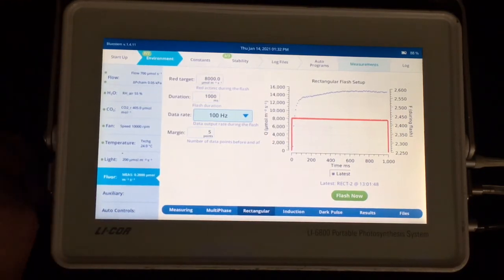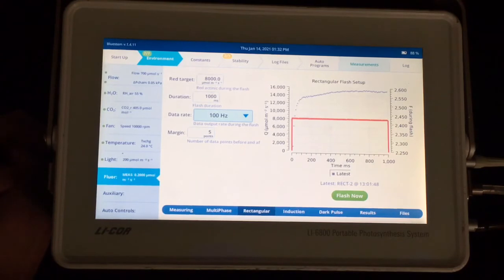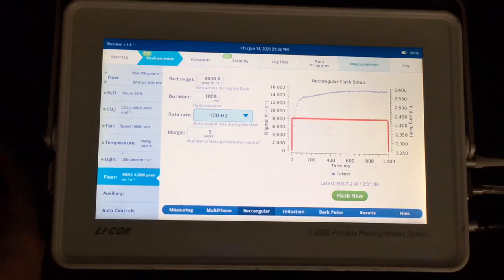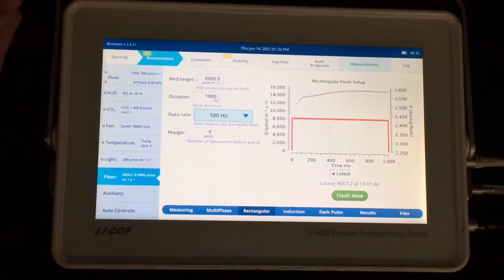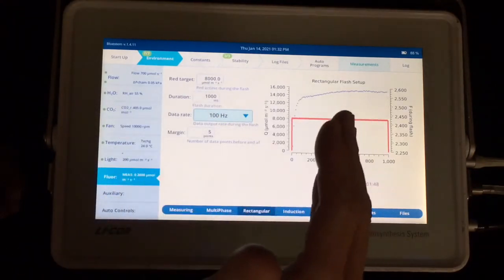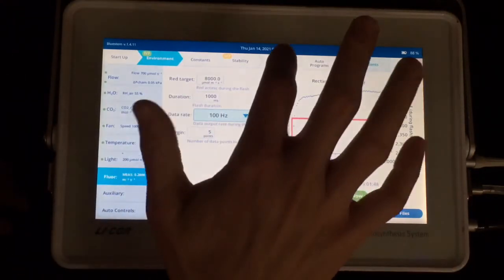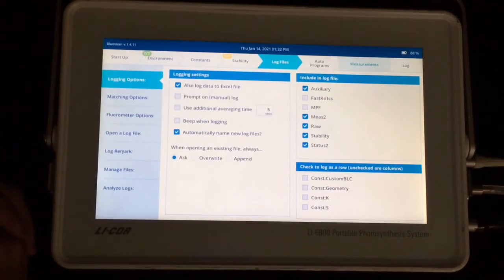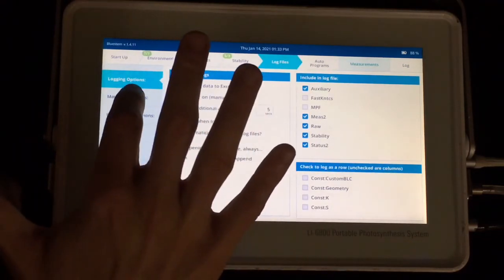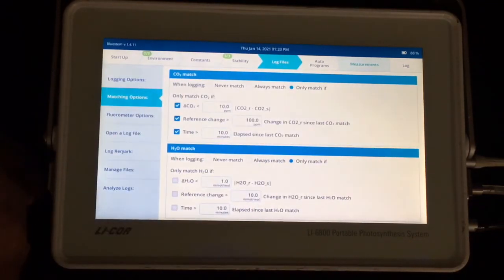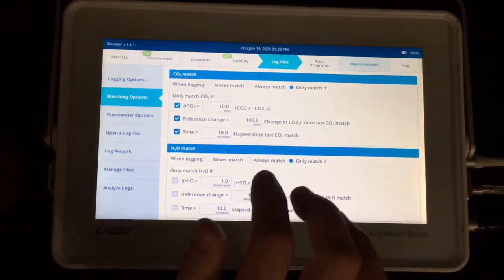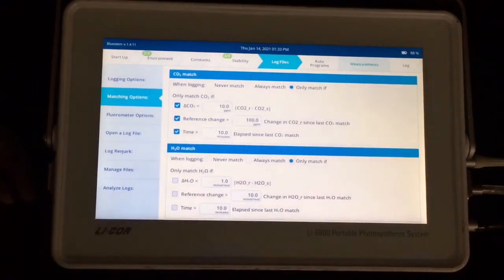So now I've got all my environmental controls set up. A few things you'd want to do before making measurements include running your warm-up tests prior to even getting to this point, making sure the instrument is performing well. And to log data, you absolutely need a log file open. So we're going to go ahead over here to the log files screen. You would want to select your logging options. I'm going to log to my Excel file.